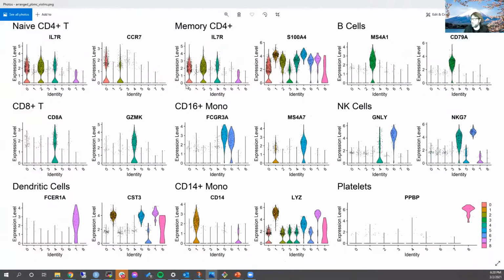Okay, if you double click on this, it now displays very nicely for you all of the cell types and the markers that you had from prior knowledge. And you can go through these by hand now, and you can scan and say, okay, are there any of these that seem to clearly identify a cluster? So in looking at this, are there any of these besides the B cells that seem to clearly identify one specific cluster? And you can pick any, you can just shout it out.